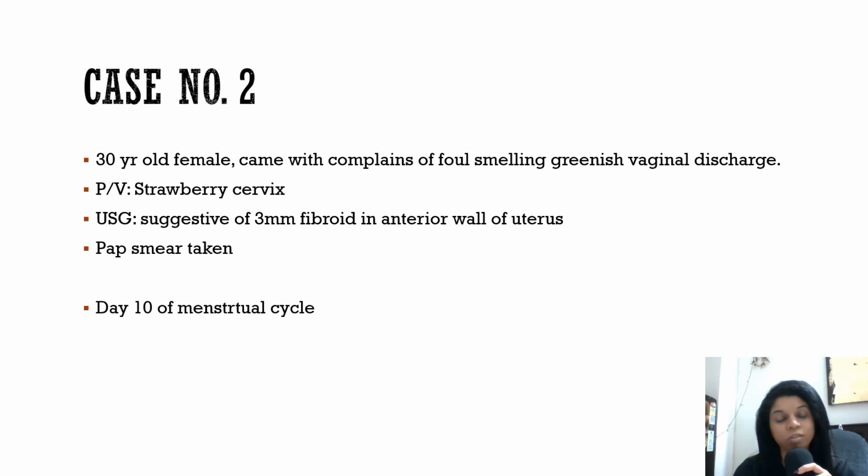You should always be a clinician first before being a pathologist. You should know the clinical scenarios very well. The classic description, the most common complaint or symptoms, and the characteristic clinical findings are things you should always remember before you go and see the slide itself. You should have some differential diagnoses in mind.